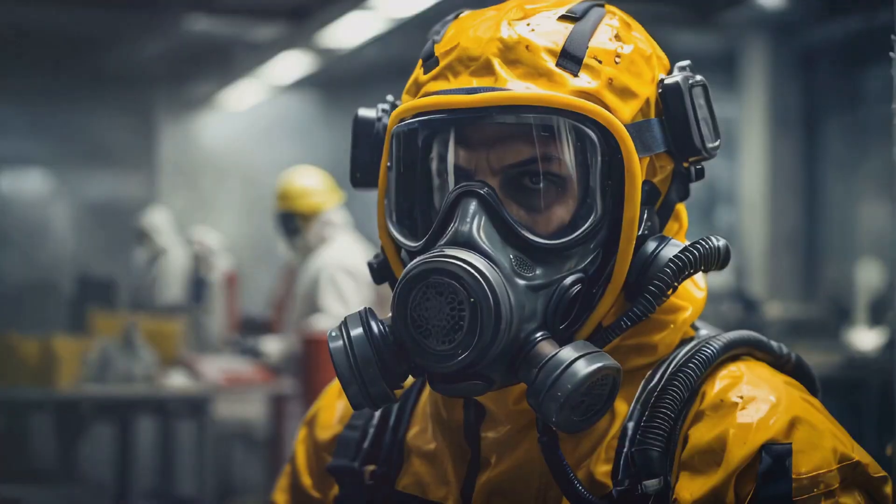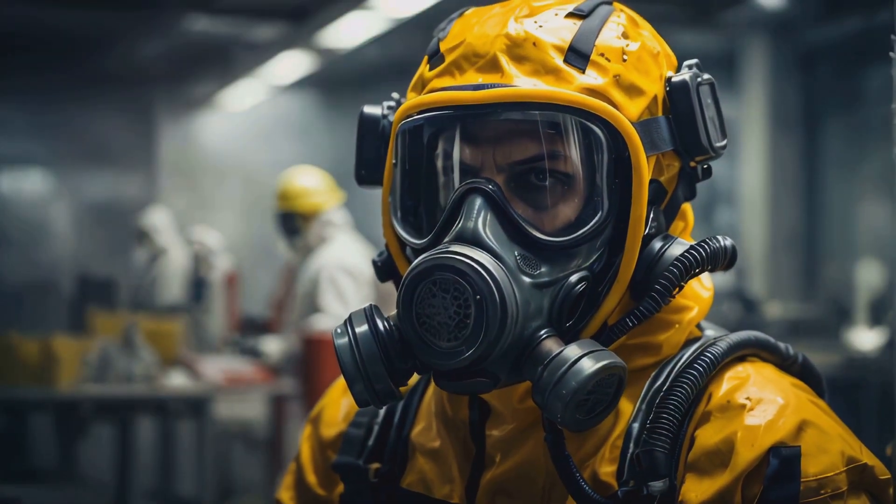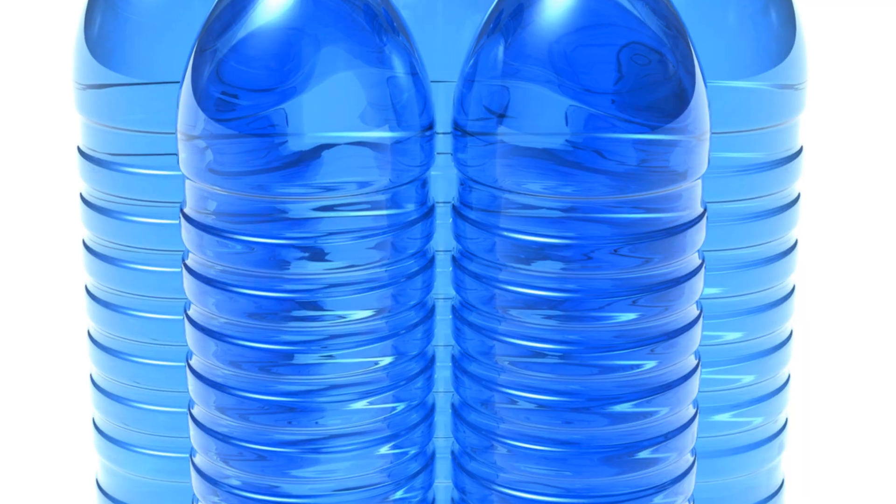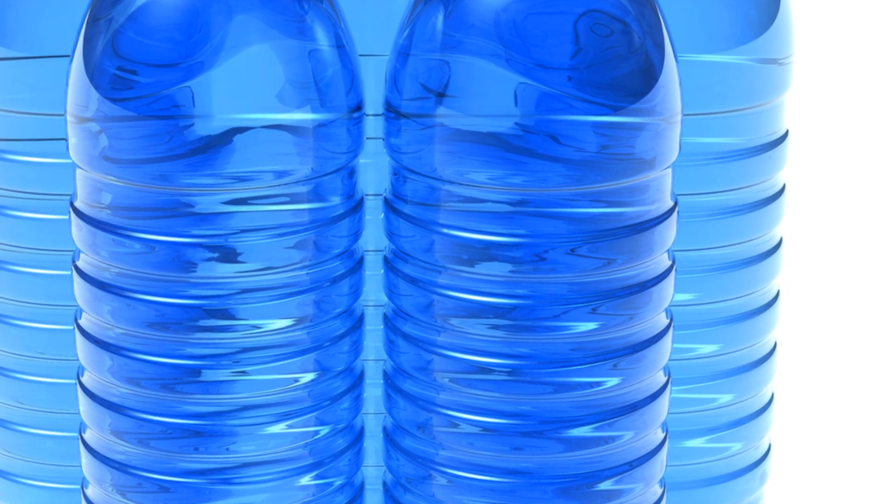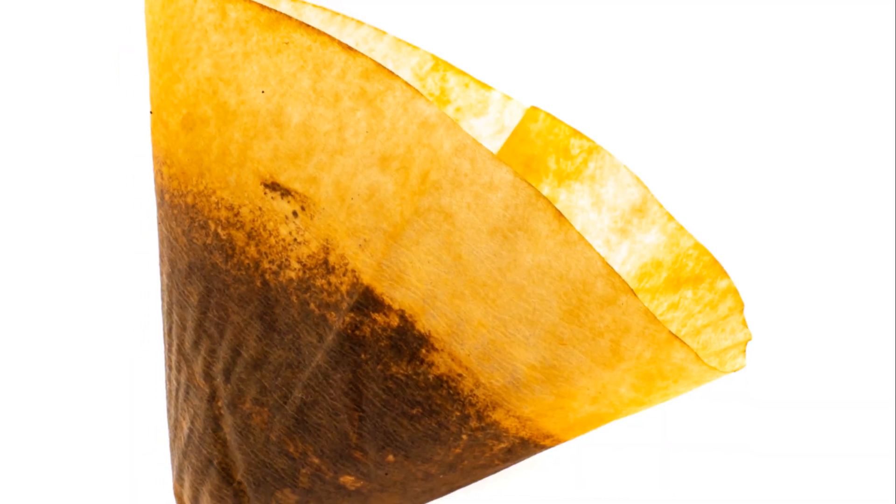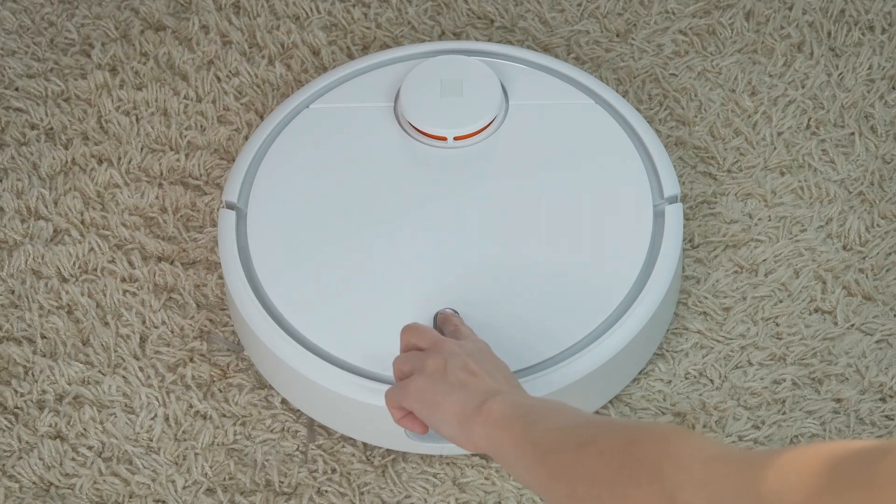The filter paper will trap the solid gold particles, while the now clear liquid, which contains dissolved base metals and other impurities, will pass through. This liquid can be safely disposed of following proper chemical disposal guidelines. Rinse the filter paper with distilled water a few times to remove any remaining traces of acid or impurities. You should be left with a filter paper containing a brownish residue. That's our gold. Carefully remove the filter paper and place it on a watch glass or a heat-resistant surface.